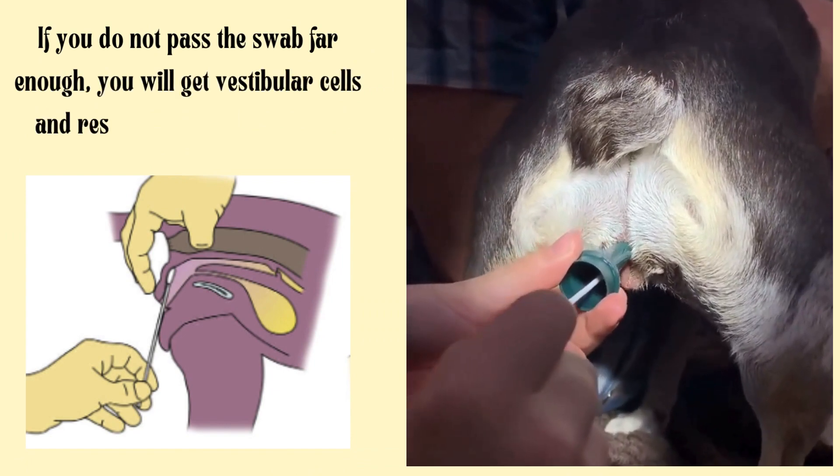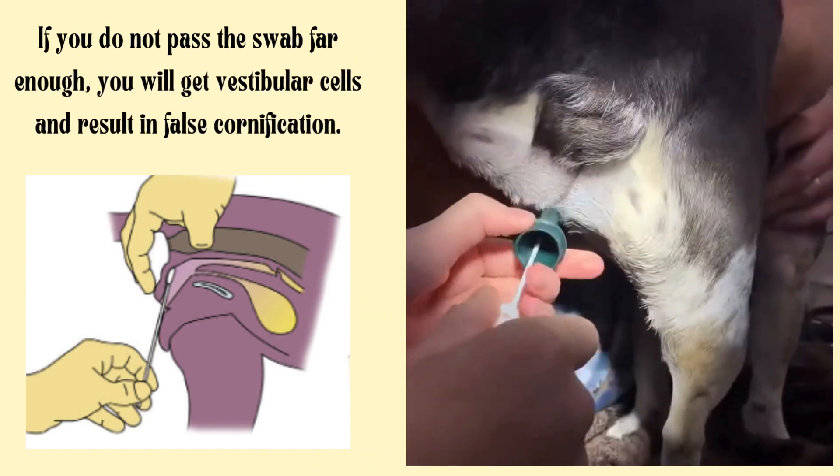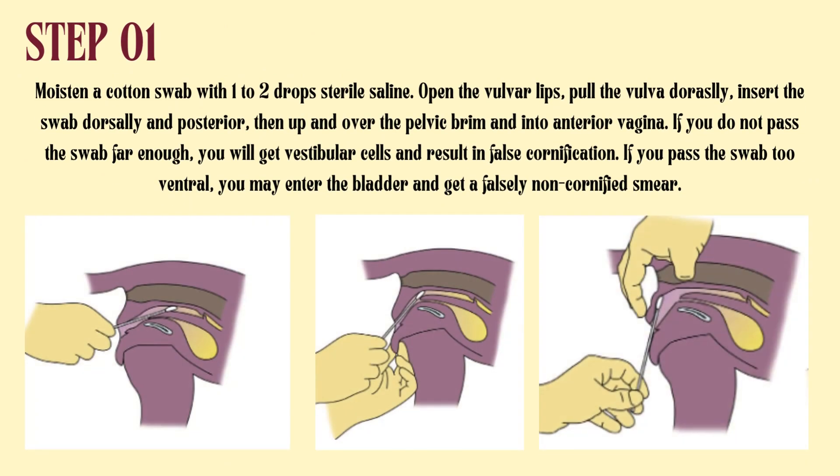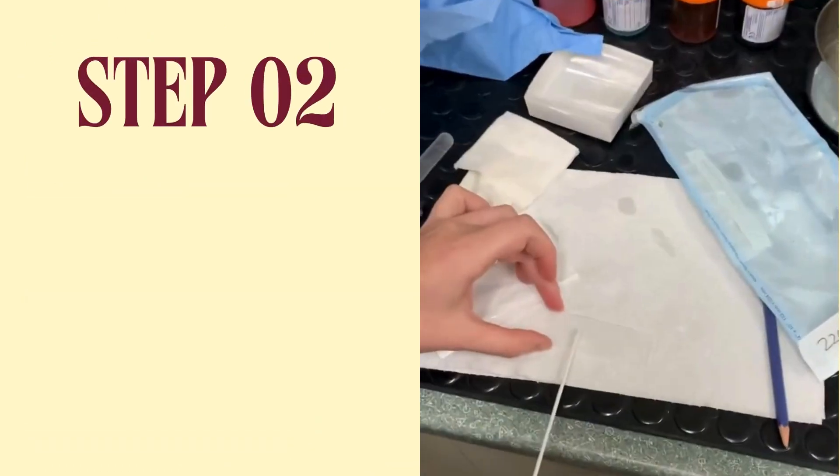If you do not pass the swab far enough, you will get vestibular cells and result in false cornification. If you pass the swab too ventral, you may enter the bladder and get a falsely non-cornified smear.